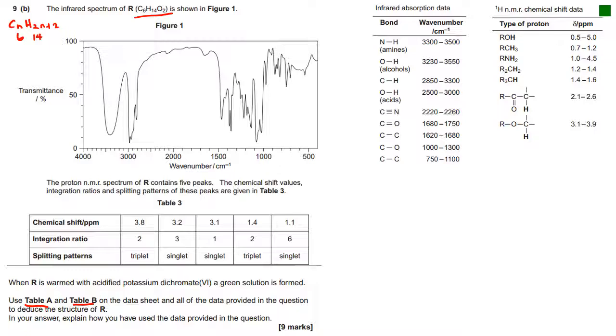But then looking a little bit closer, we've got 2 oxygens in there. So if we've got a molecule with 2 oxygens but no double bonds, it could be an alcohol. All right, so you could have 2 hydroxyl groups and make it a diol. It could be an ether, and you could in fact have 2 ether links in it, or it could have 1 of each.